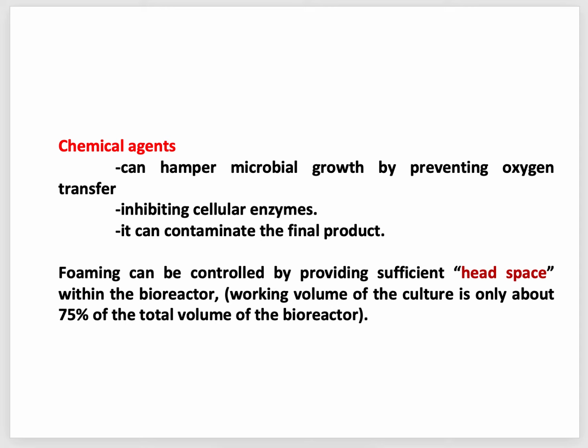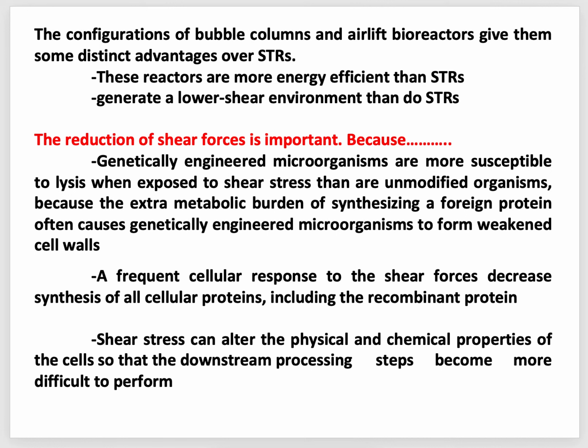Okay, so this was about some parts of the bioreactors. Now again, let's talk about some advantages of bubble column bioreactors and air-lift bioreactors over stirred tank bioreactors. Bubble columns and air-lift bioreactors have some advantages over STRs, such as being more energy efficient than STRs.